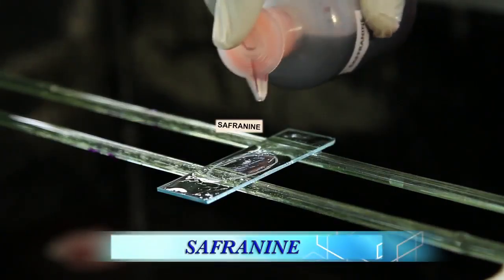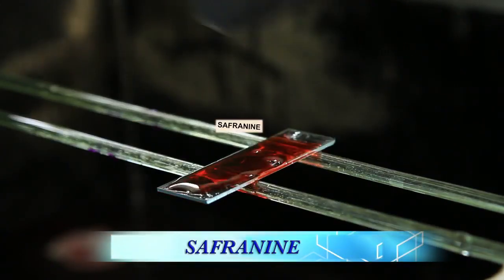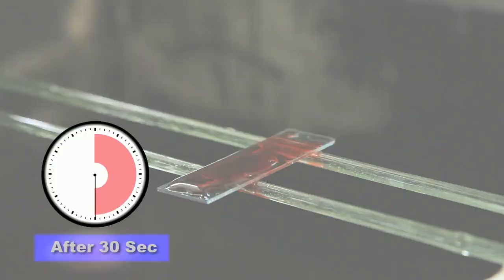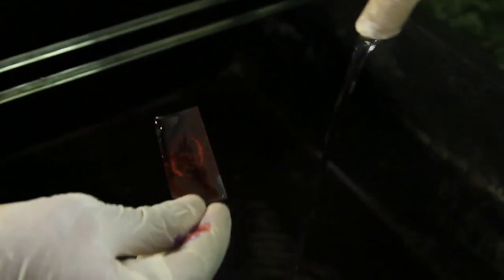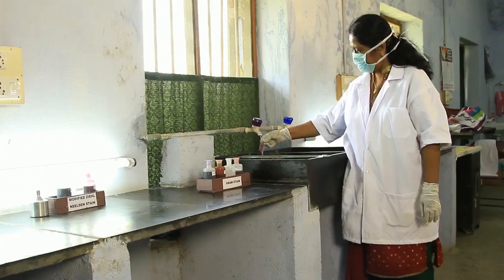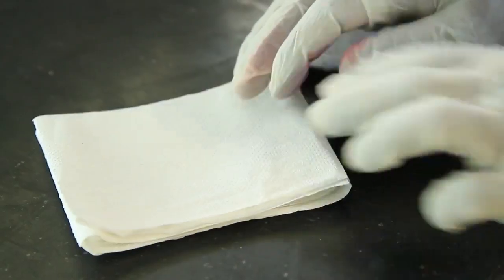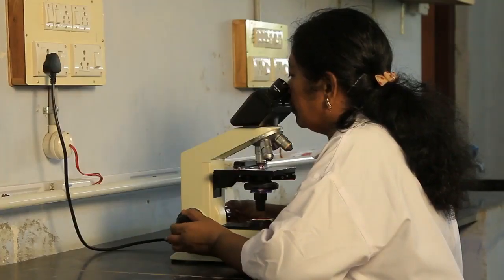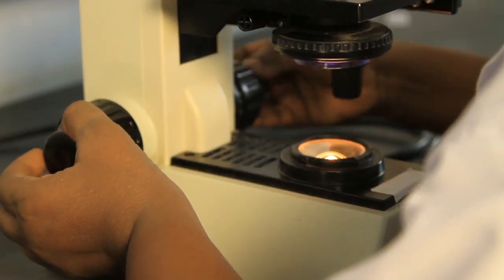Gently flood with safranin to counterstain. Cover the smear and let it stand for 30 seconds. Wash with a gentle stream of tap water. Let the slides air dry and blot gently. View the slide using a light microscope under oil immersion.